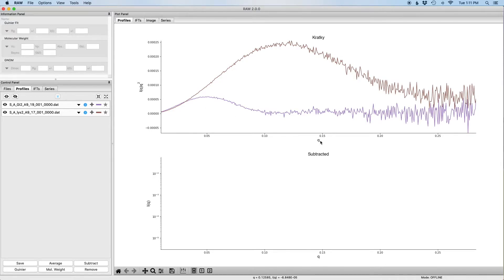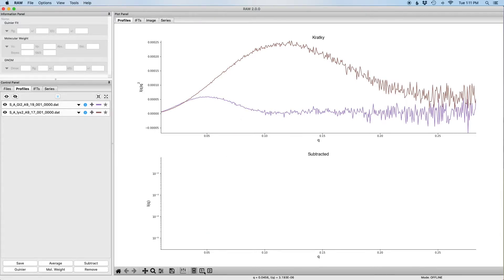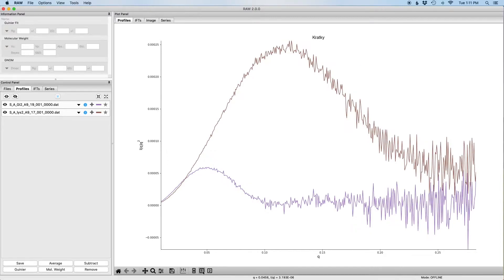So Kratky plot plots I times Q squared versus Q. To make this a little bit easier to see what's going on, the other thing I can do is show only the top plot on the screen. So if I go down to the bottom bar here you can see currently it's on one two, we're showing both plots. I'm just going to click on one which is going to show the top plot.